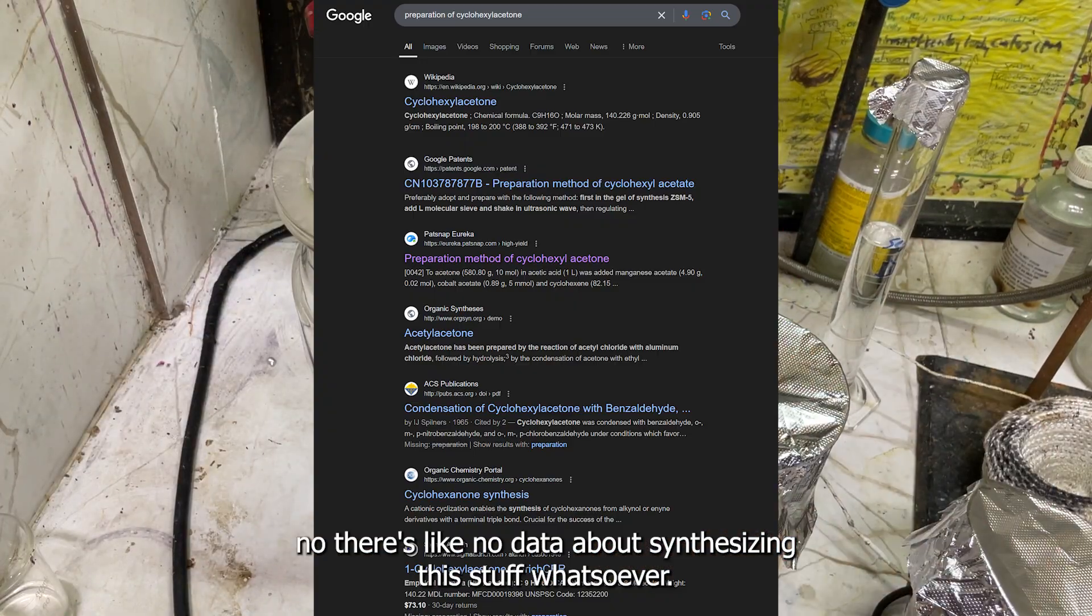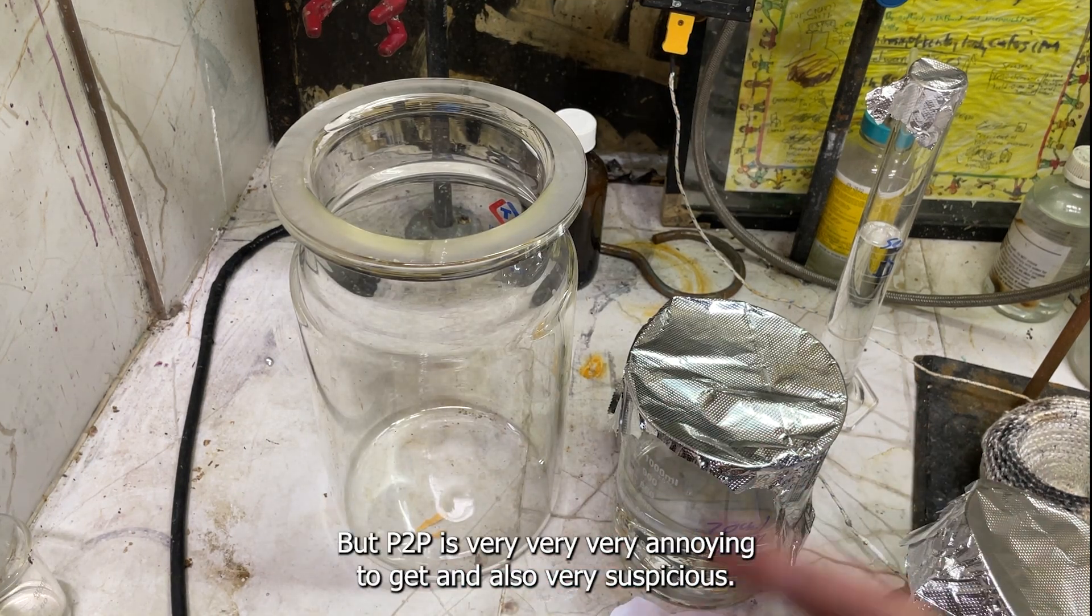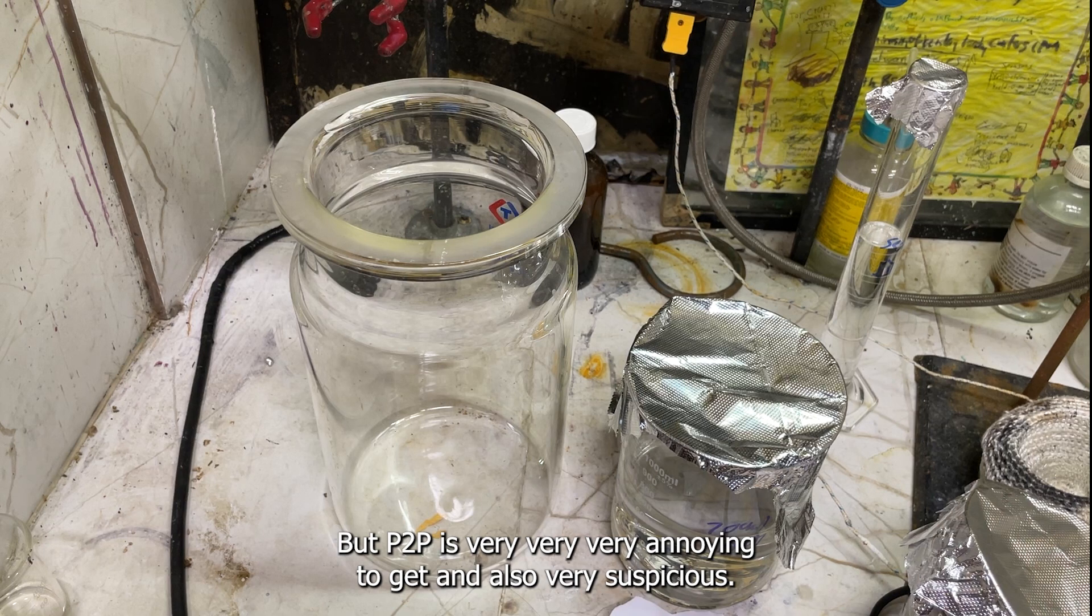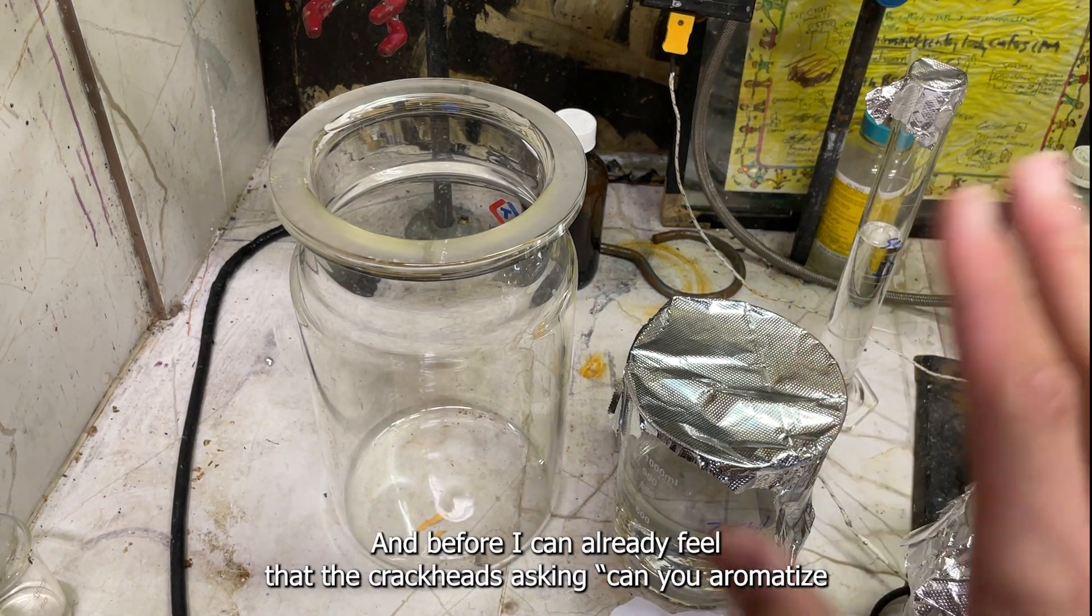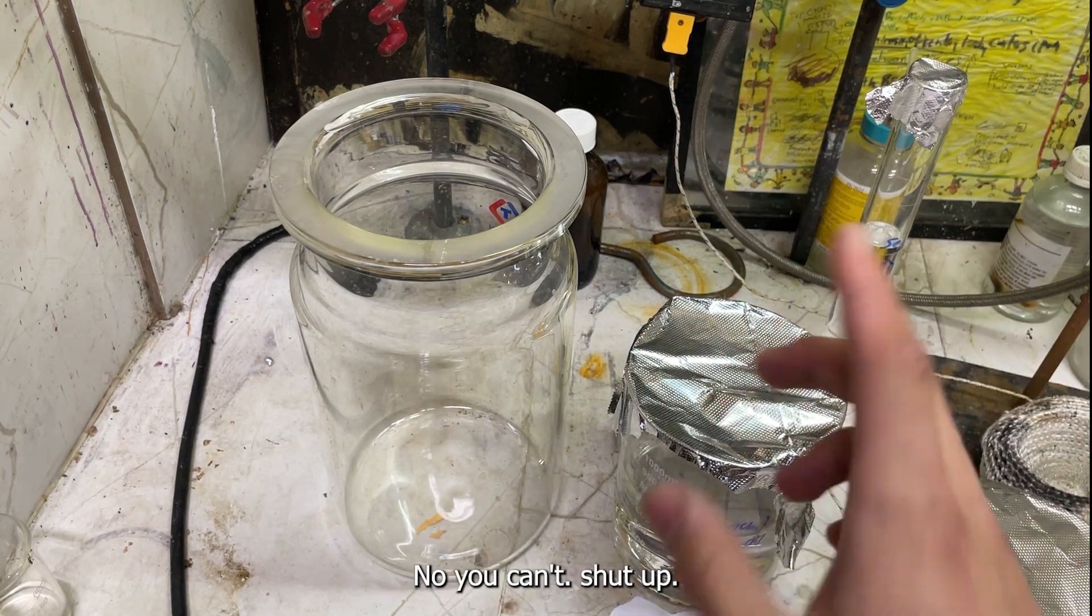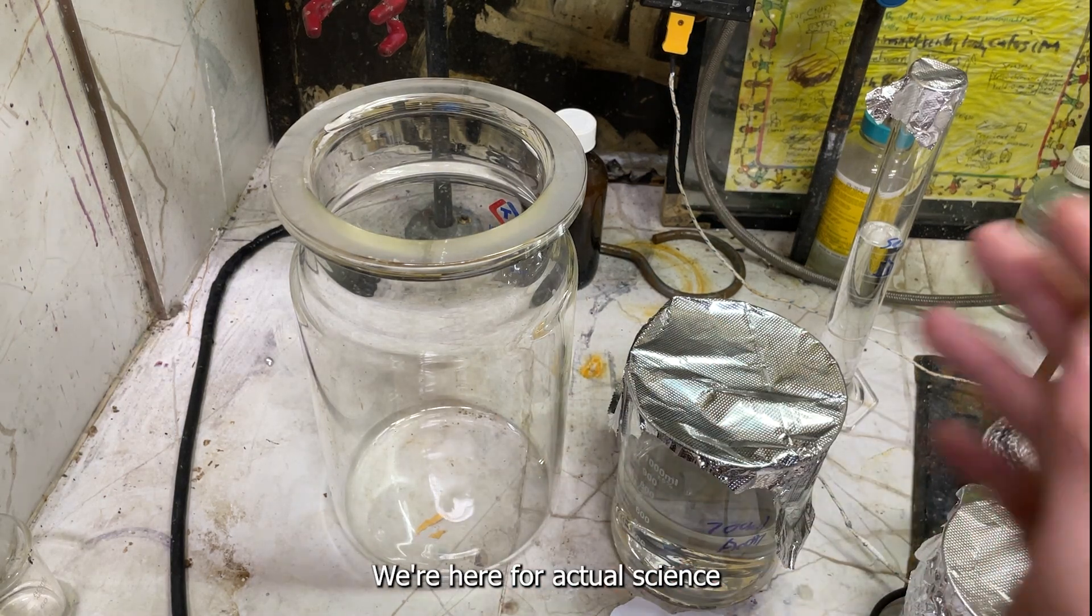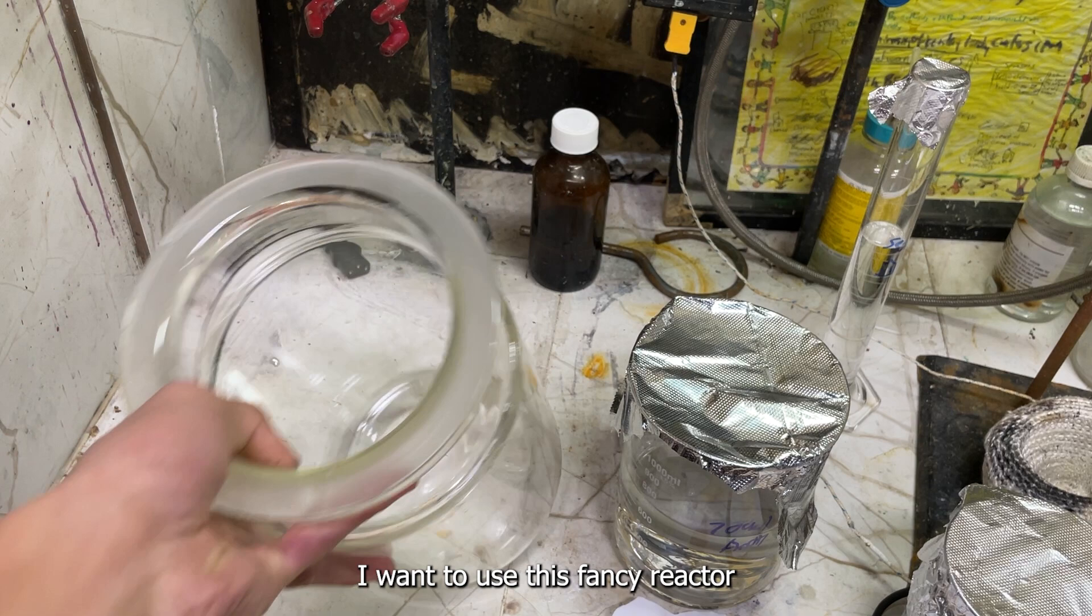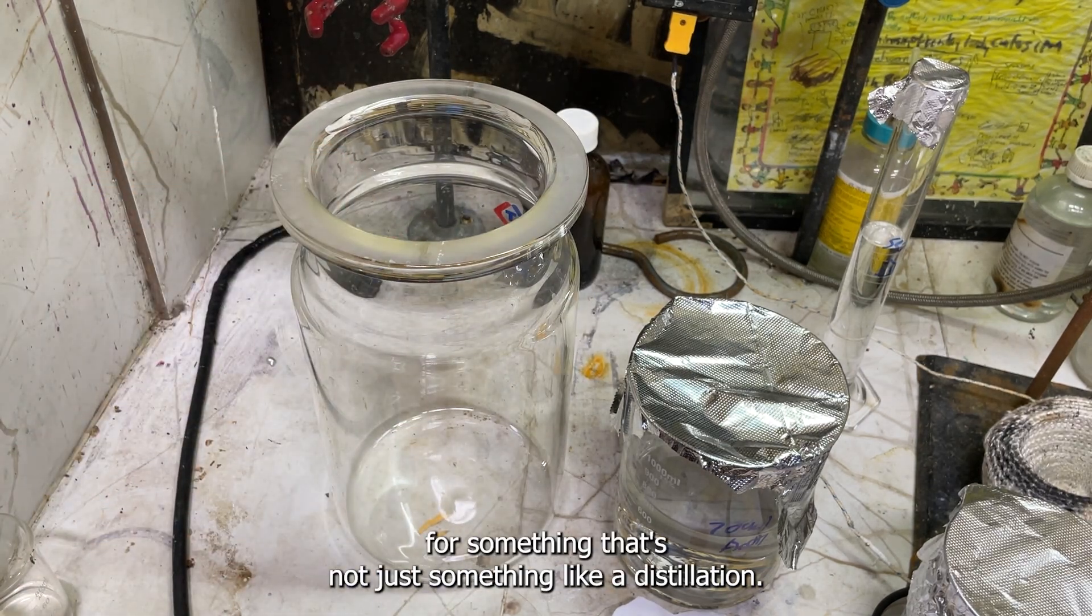There's like no data about synthesizing this stuff whatsoever. My first thoughts of course would be hydrogenating P2P, but P2P is very very annoying to get and also very suspicious. Before I can already feel the crackheads asking, can you aromatize this to P2P? No you can't, shut up, leave the video, I don't care. We're not here for that kind of chemistry, we're here for actual science. I want to use this fancy reactor for something that's not just a distillation.